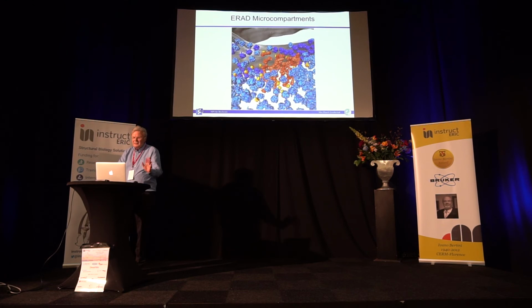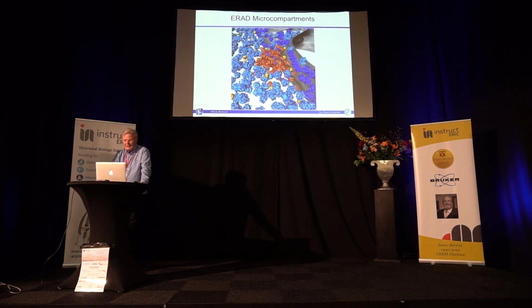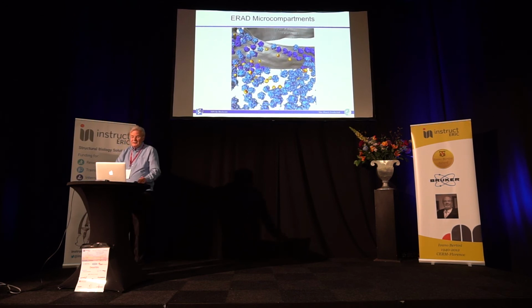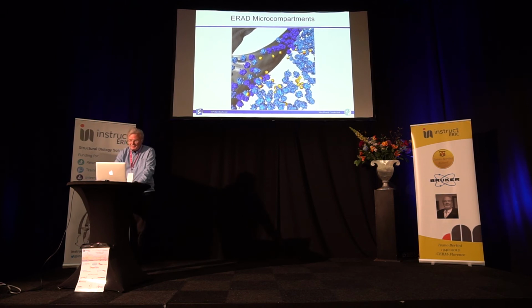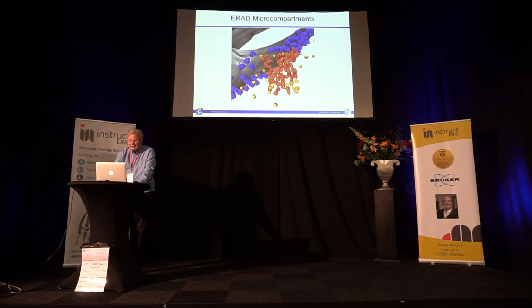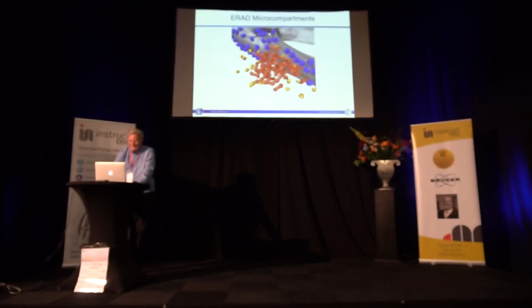Now, it was a bit surprising that CDC48 did not show up where we expected it, basically next to the membrane. Instead, many of the 26S proteasomes were directly interacting with the endoplasmic reticulum. So that is a cluster. You see, I think basically there are no ribosomes intruding into that cluster here.